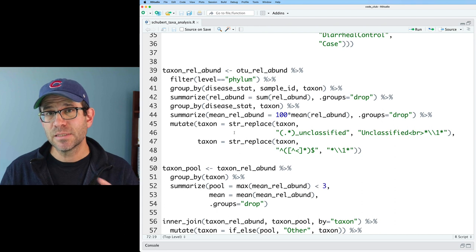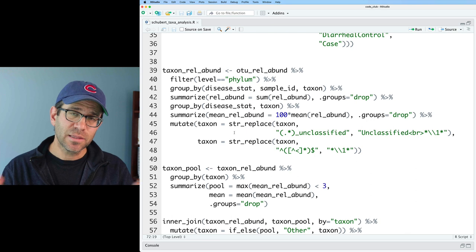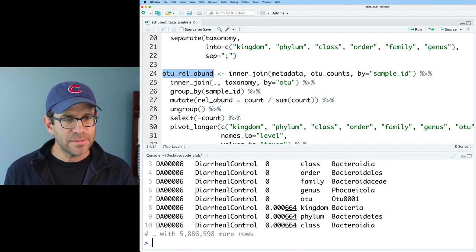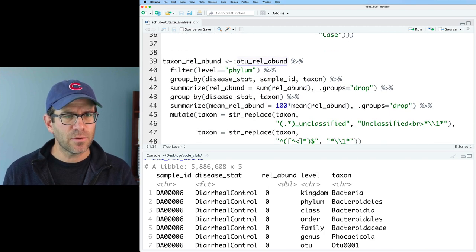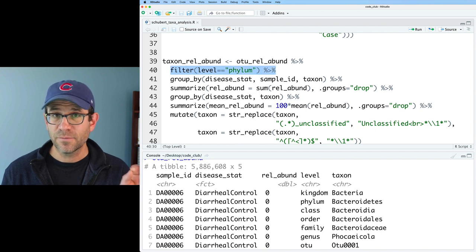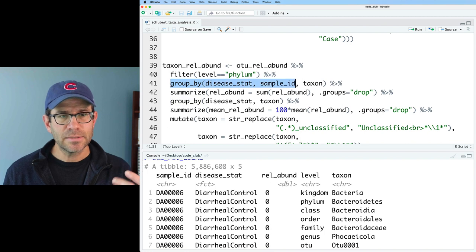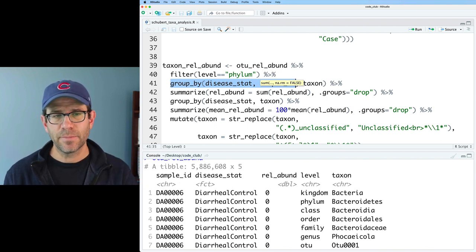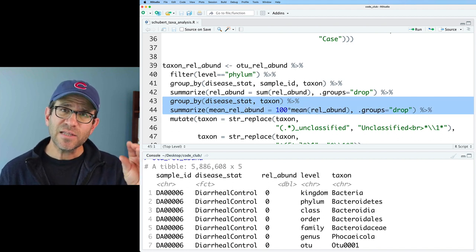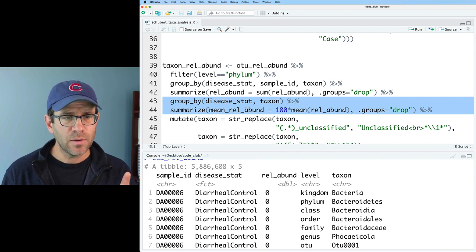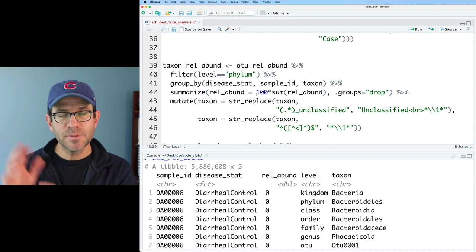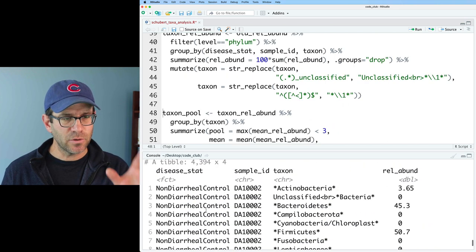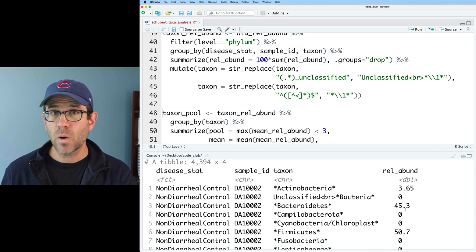So the first thing that we need to do is break apart the data so that we're not aggregating things together by disease status, but that we're keeping things separate at the subject level. We've done this before in a previous episode. But just to remind ourselves, if we look at OTU-RELA-BUND, that does keep the subject sample ID. Now down here in taxon-RELA-BUND, we go ahead and we group, we filter at the phylum level to pull out the phylum information. We then group by disease stat, sample ID, and taxon. And then we group things together, group OTUs together that are from the same phylum. And then down here in lines 43 and 44, that's where we aggregated across the disease status groups. So I'm going to go ahead and remove those two lines, but I'm going to add back in the 100 times my sum-RELA-BUND so that I can report my relative abundance as a percentage. Let's go ahead and run taxon-RELA-BUND. And we see that we have our disease status group, our sample ID, the taxa, the phylum that it's coming from, as well as the relative abundance.